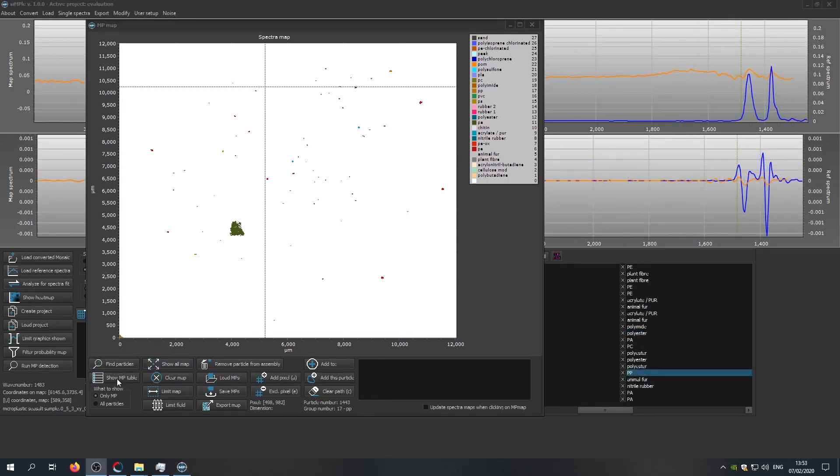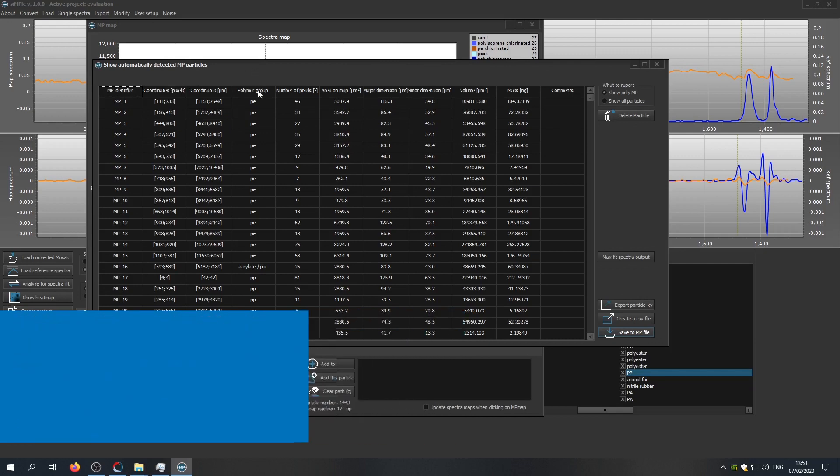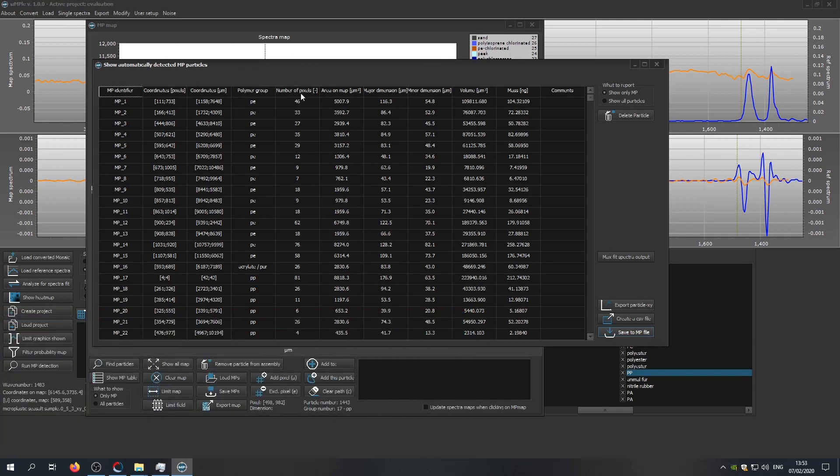By clicking on show MP table, we can access a list of all particles that have been found. The information available includes the coordinates, the polymer identity, the number of pixels, which corresponds to an area on the map, the major and minor dimensions of the particle, as well as its volume and its estimated mass.